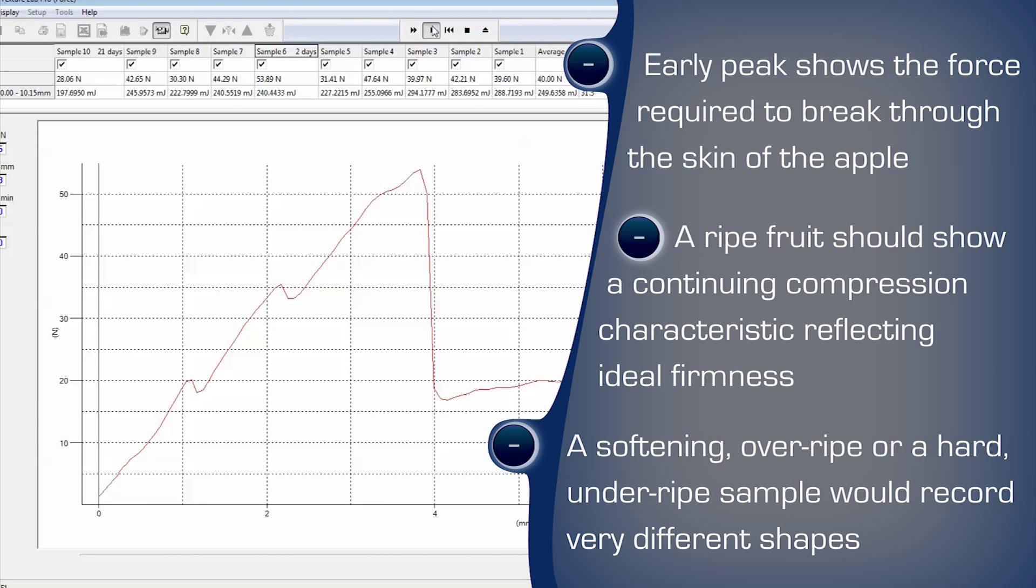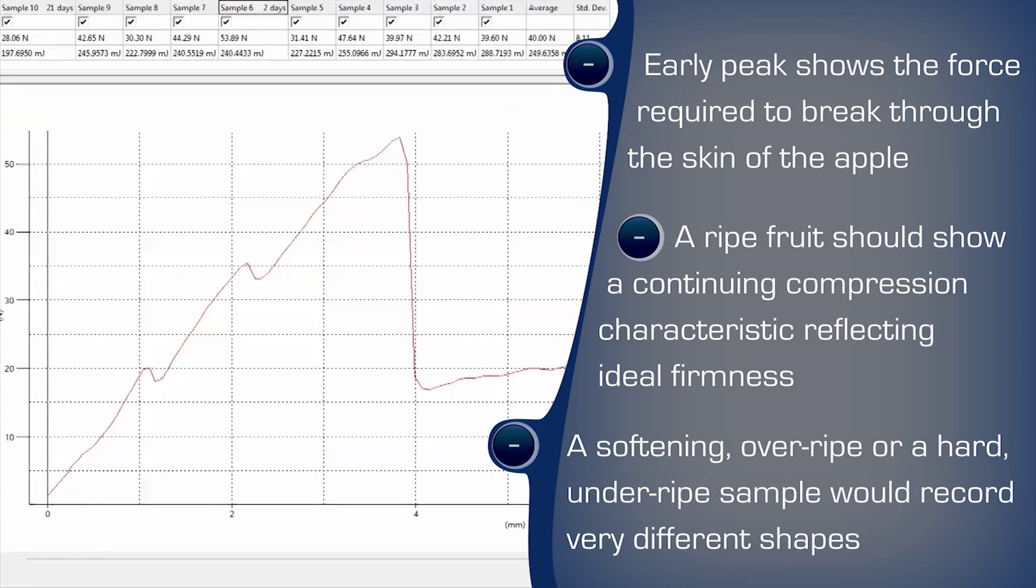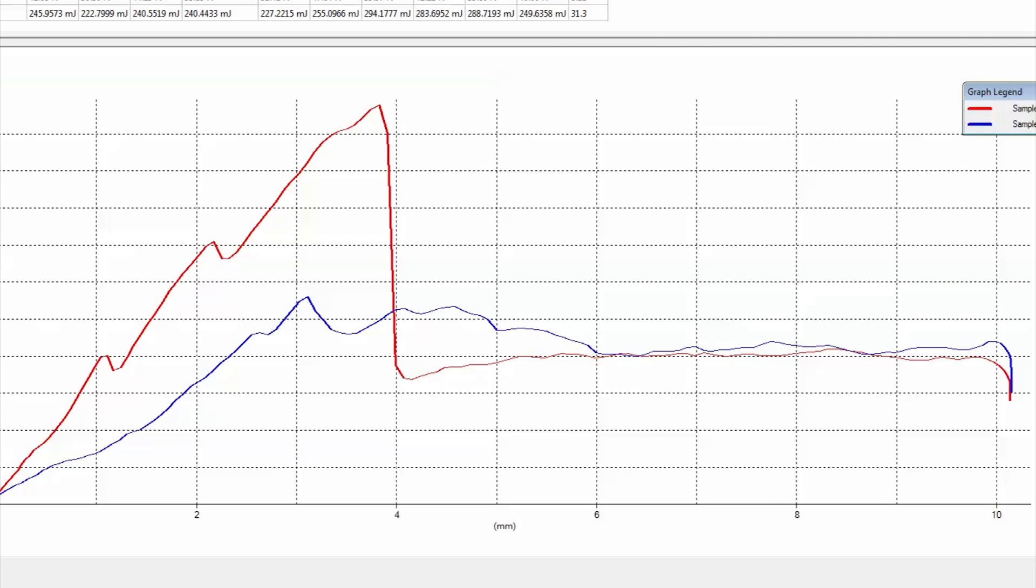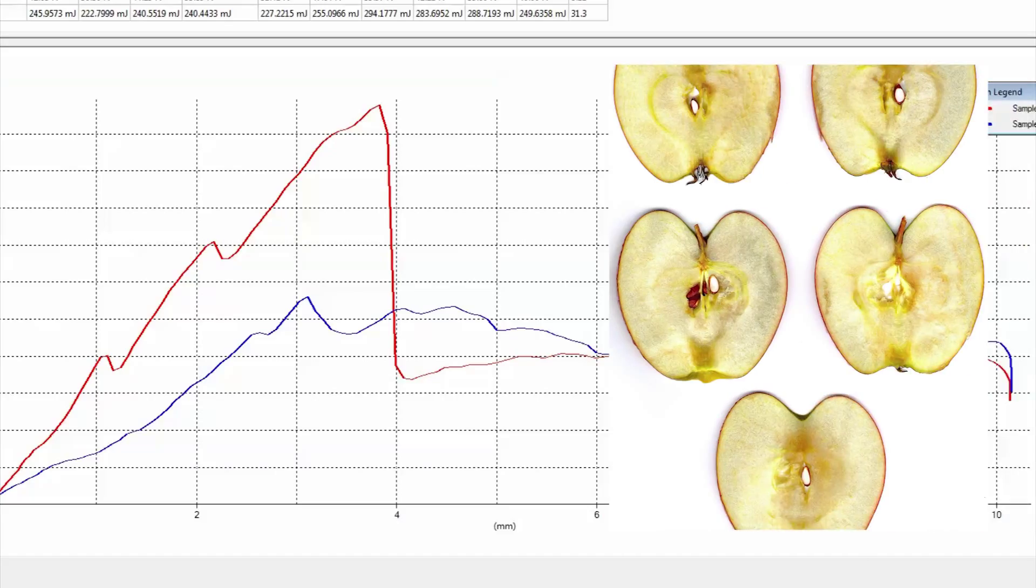The early peak shows the force required to break through the skin of the apple. Beyond this bio-yield, a ripe fruit should show a continuing compression characteristic reflecting ideal firmness. A softening, over-ripe or hard, under-ripe example would record very different shapes.